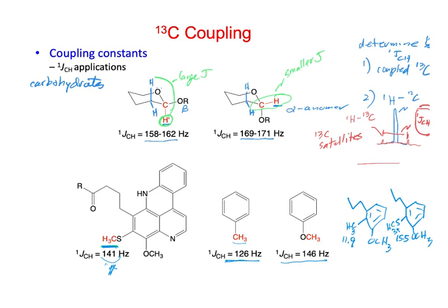So they measured, and I can't remember if this was the one they measured or if this is the kind of standard or baseline for that. But they measured this one bond coupling constant, and that was much more consistent with the thiomethyl rather than the methyl directly attached to the benzene ring.